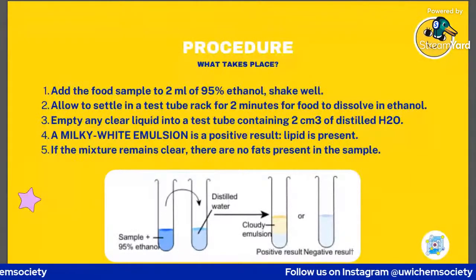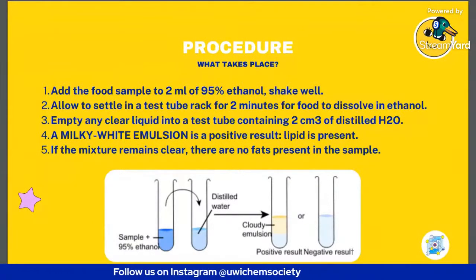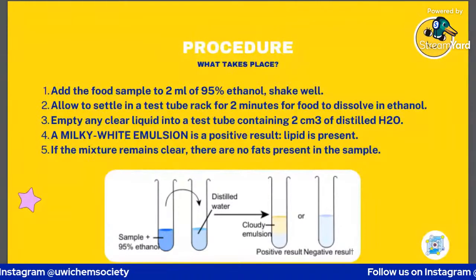So we're going to use oil. Let's see. And we're going to add 2 mils of ethanol to it.